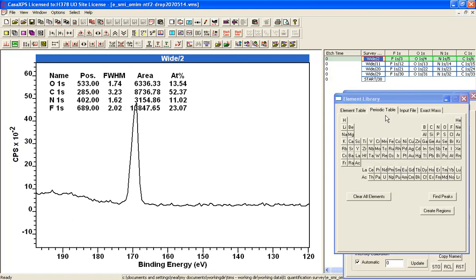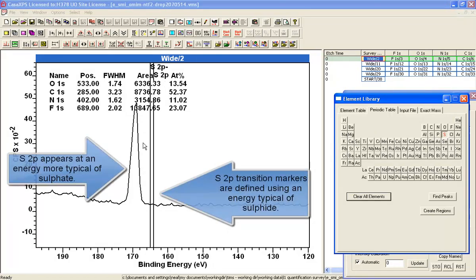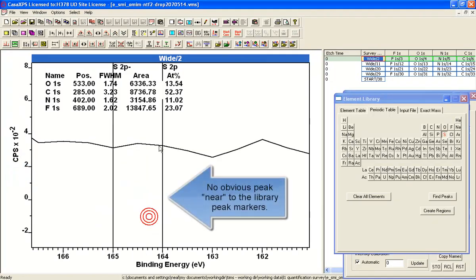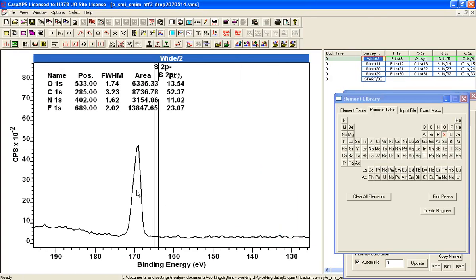And the reason for that is that when I bring up the Sulphur line for the 2P, you can see that there is a significant gap between where the element markers are and where the peak is. And that's understandable in terms of the chemistry. This is going to be a sulphate-like peak and the line has been entered into the element library that is consistent with a sulphide. And Sulphur does respond by energy shifts according to the chemistry. So there's a good reason why it didn't find it, but the problem is that having not created a region, we now need to create a region.